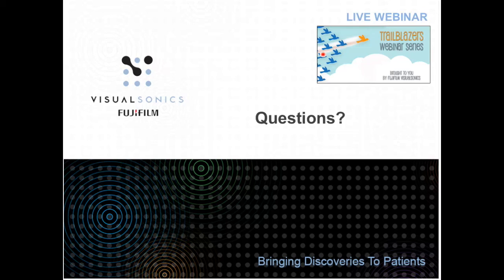Now, as far as changes in fluence, which essentially is light energy per unit area, so changes in the energy of the light at different depths, it's possible to apply very general corrections for that, and this has been done by different research groups. We don't do this specifically because it's very easy to do in a phantom. It's very difficult to do in vivo. You've got different amounts of vasculature and different tissues, and it becomes difficult to predict.